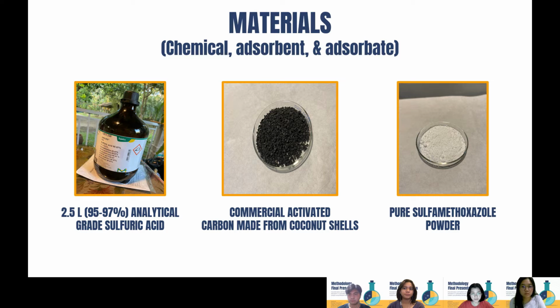The materials used in the experiment are the following: 2.5 liters of 95 to 97% analytical grade sulfuric acid, commercial activated carbon made from coconut shells, pure sulfamethoxazole powder.